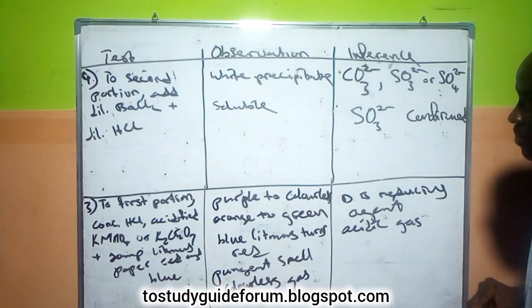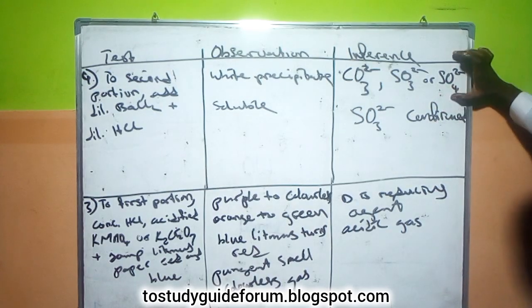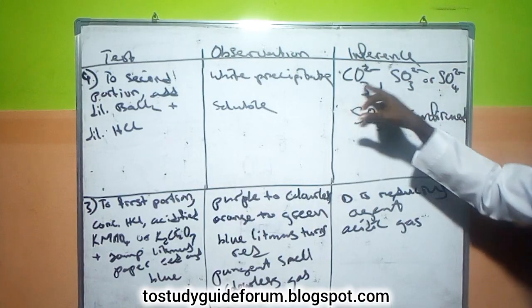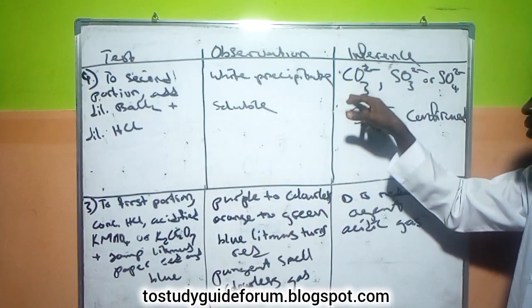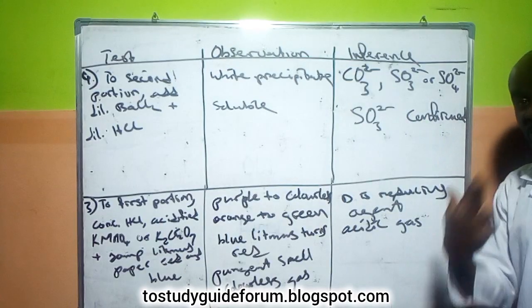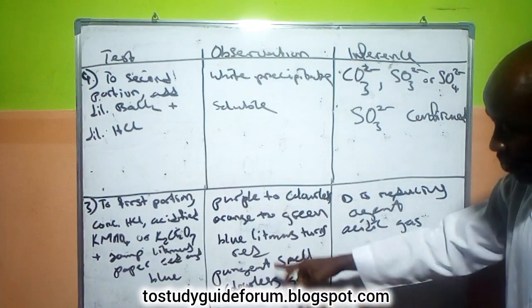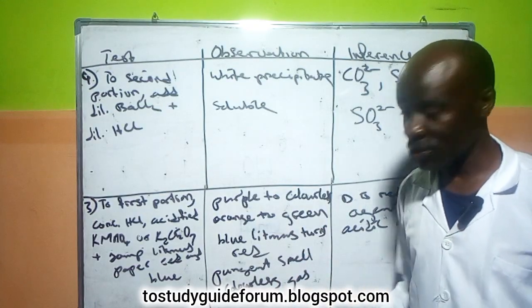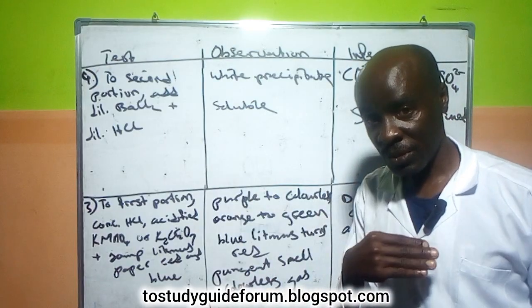confirmed. Now this one is insoluble, but these two are soluble. If these two are soluble, but this one does not have a smell, but we have a smell here, like I told you, it is pungent. Naturally, if you are used to lighting matches, you really know that the smell you're getting smells like burning matches. Is that okay?